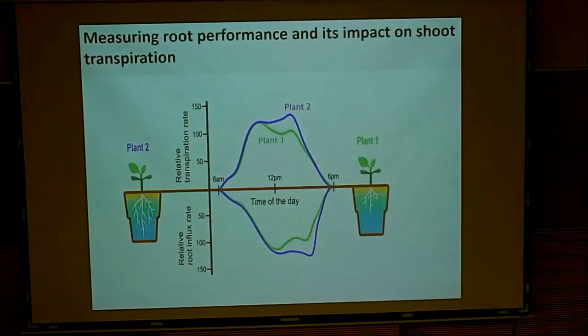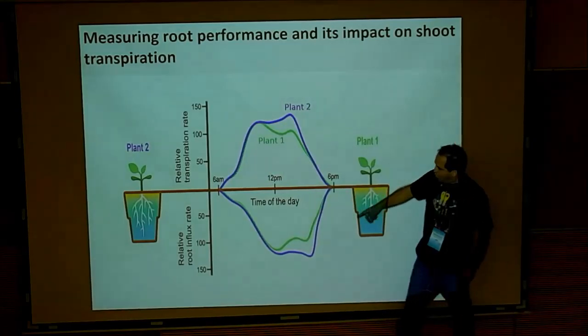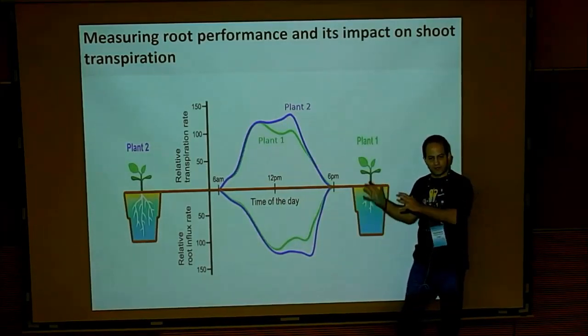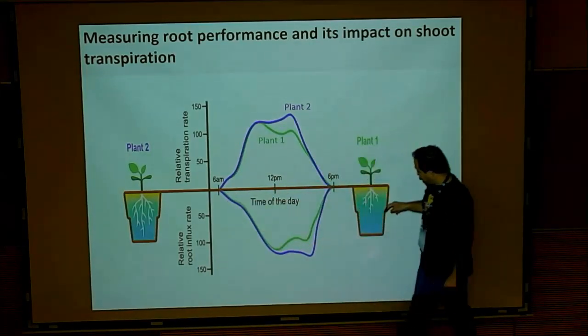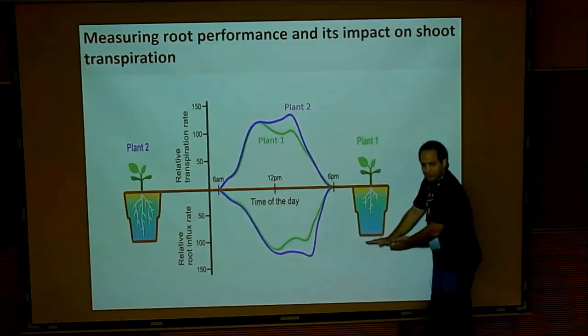So another thing that we do, since we have a probe in the soil all the time, we can take the content continuously. Of course, there is a lot of noise. Each one of you that work with probe know this. But this is part of the system algorithm to help us get rid of these noises. And then if you measure continuously the soil water depletion from the pot, theoretically, it should be equal to the one coming from the lysimeter, right?